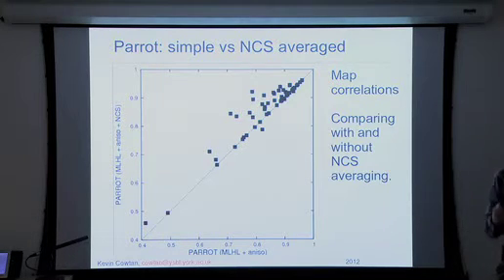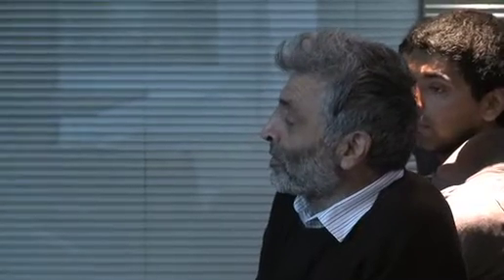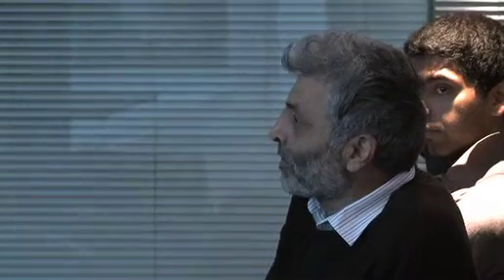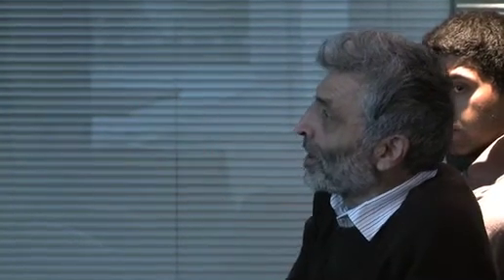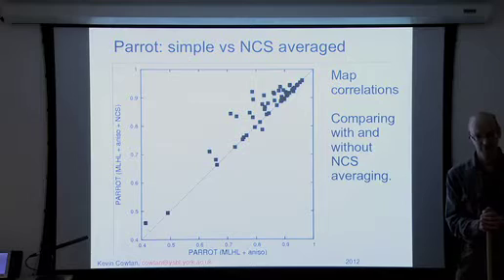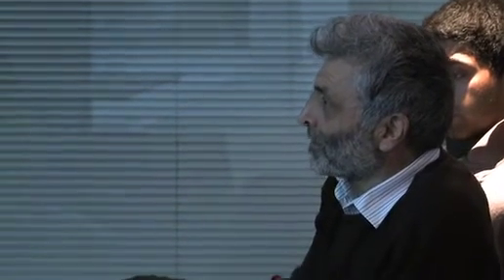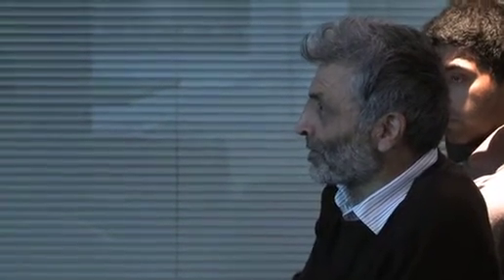I have one question about NCS. Usually when you have a molecular replacement or something, you have one part of the structure you already know, and what you are interested in is another part. Yes. And masks may only have information about the part you know. Yes. And when you do averaging, the parts you are interested in may be suppressed. Is there a way of dealing with that?